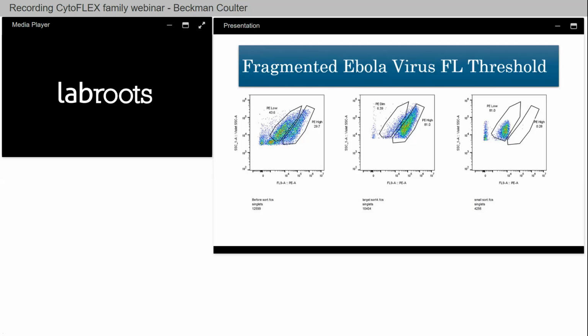So this is just really to hammer home how it's all visual, right? It's how we've been pre-programmed to look at success. We look at success on, did we increase the population? Did we enhance what we were supposed to sort? And when you look at numbers, when you say, well, the other ones were only like 1%, 2% or 10%. Now we've got 80%. So this is much more successful.